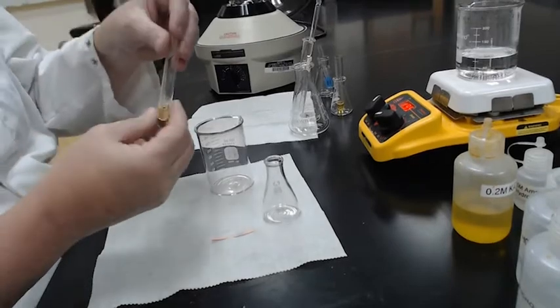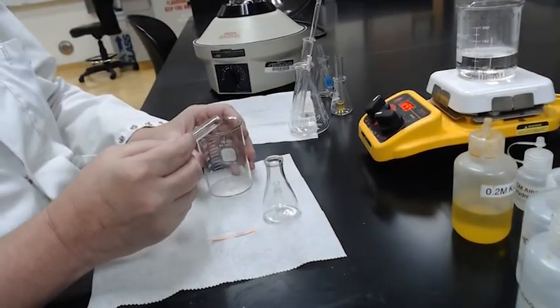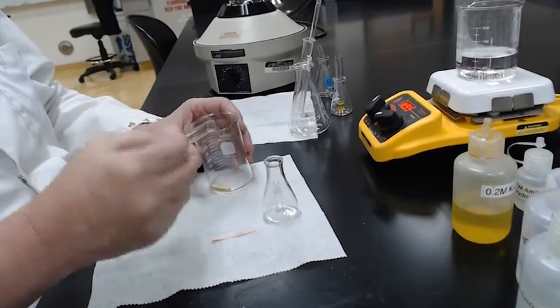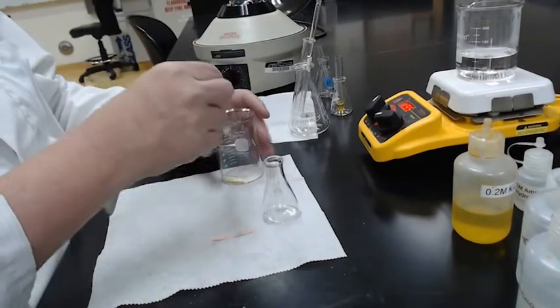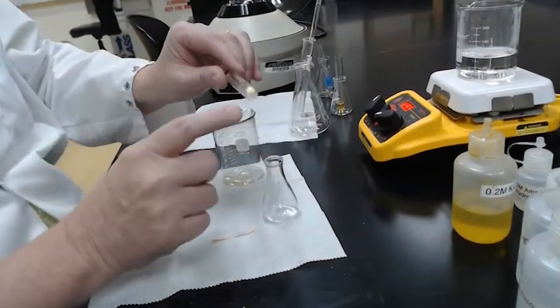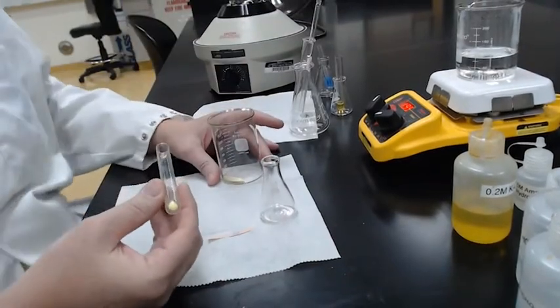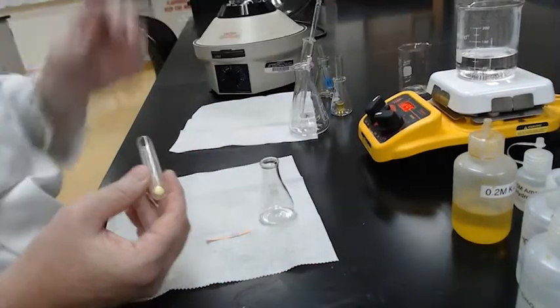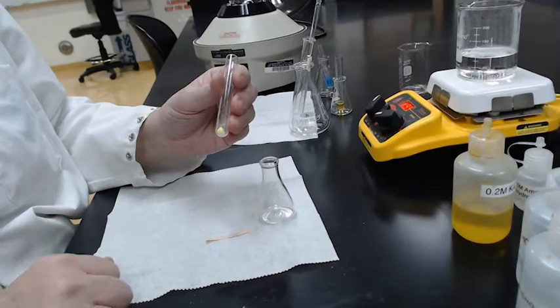Continuing, we have now centrifuged after we did a water wash, and that's to try to remove as much of the chromium excess liquid as possible. And this liquid does not need to be saved for anything, so I'm going to discard it into my waste beaker. We now have a basically clean precipitate that we suspect is barium chromate. So we're going to confirm that test right now. Let's get the waste beaker out of the way by dissolving this and doing a flame test.